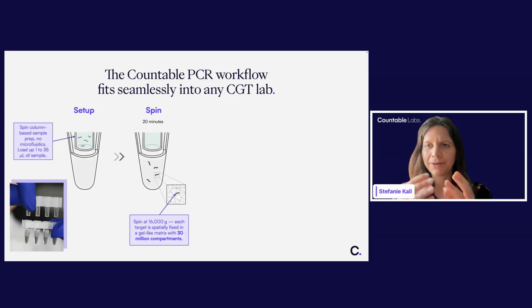And as you can see from the zoom in picture that we have there, each single target really gets locked into this picoliter sized compartment. So it's truly isolated and amplification can occur unbiased.